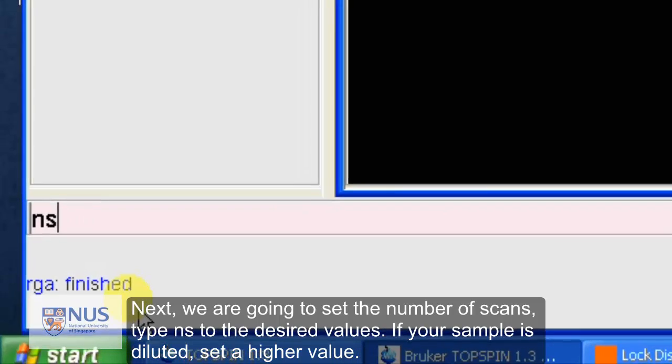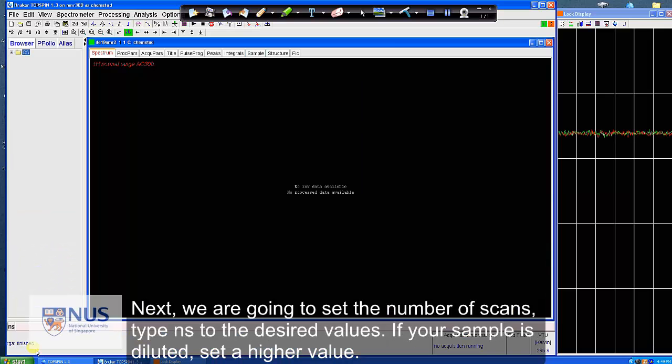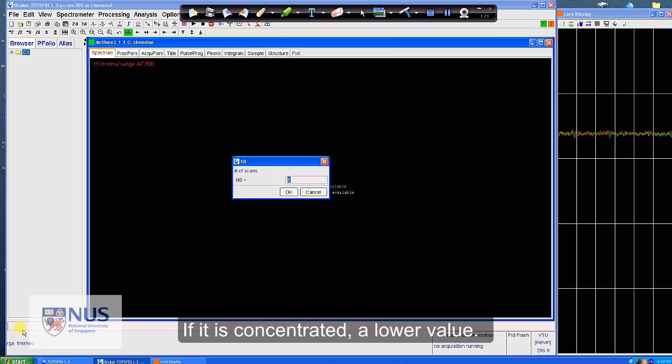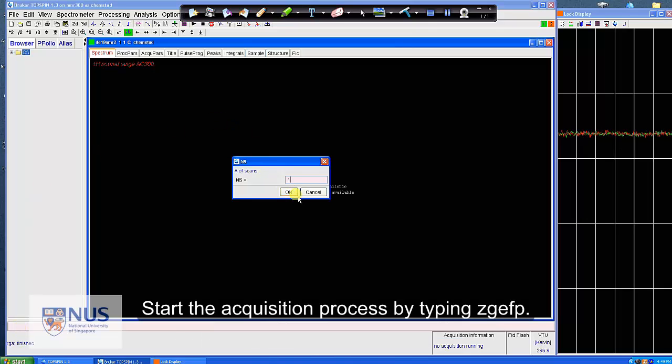Next, we are going to set the number of scans. Type NS to the desired values. If your sample is diluted, set a higher value. If it is concentrated, a lower value.